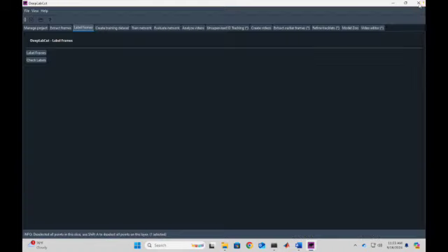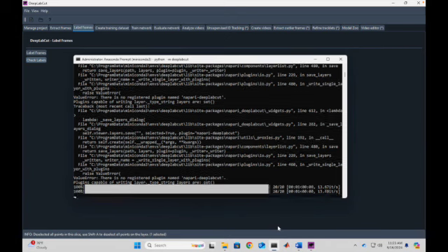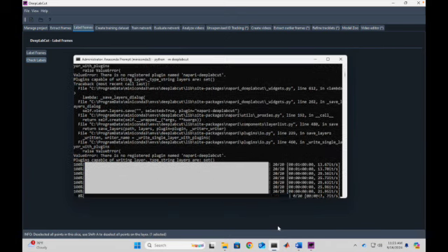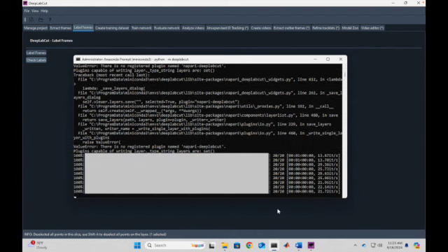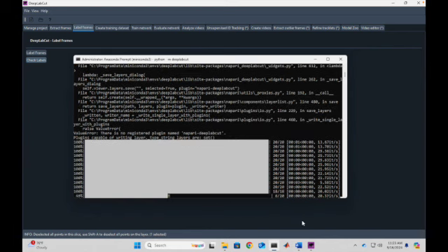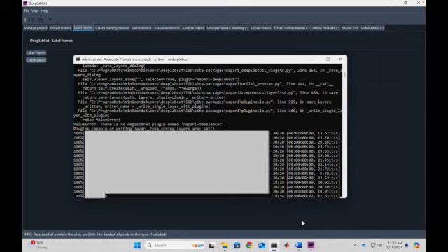So now we can close out of this Napari viewer and we can select check labels, and that will just do a rough check to make sure things aren't in crazy different points. Oh, and it's going to check every single label for every video that it's been trained on, so it's going to go through a lot of these.